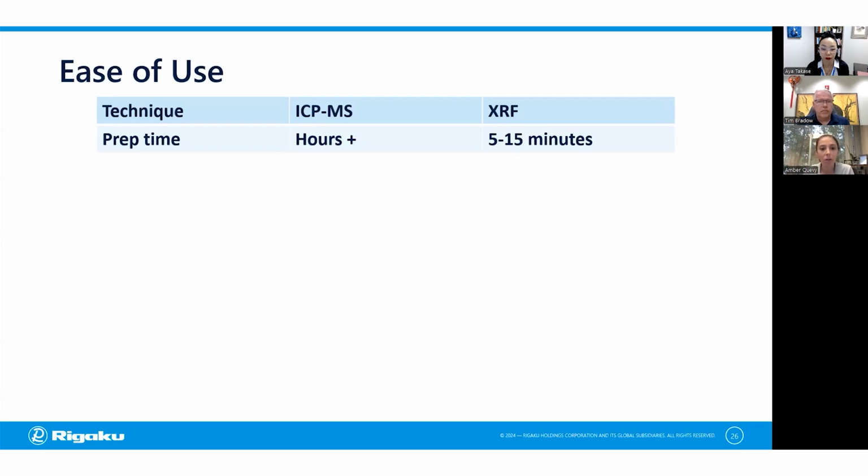If you're just dumping some powder in a cup, it's going to take a lot less than 5 minutes, I promise. Whereas typically it's going to be hours on ICP, in the case that you're calibrating for a wide range of elements.